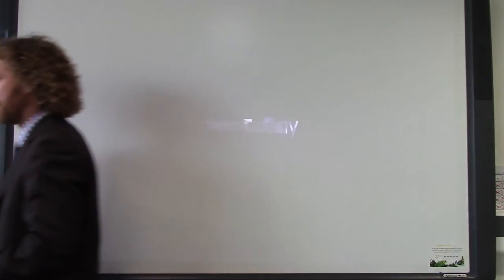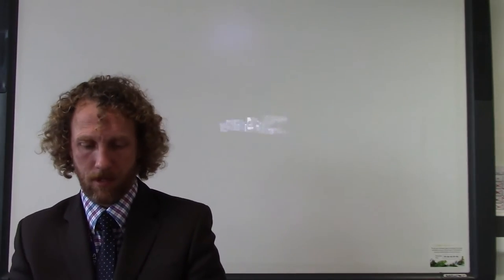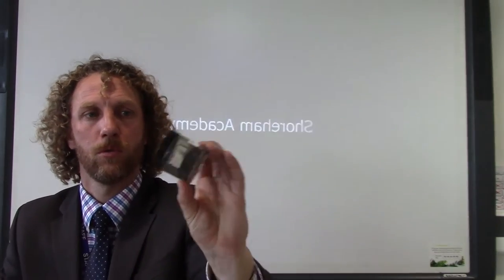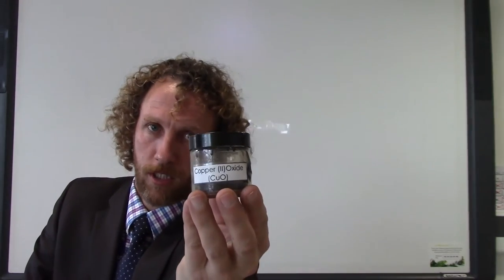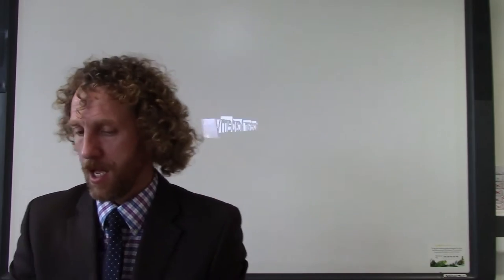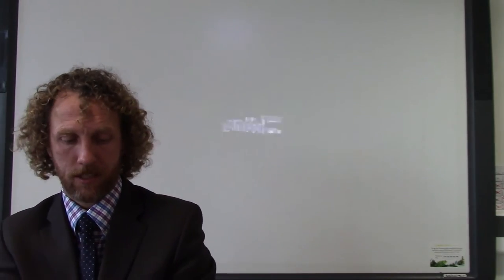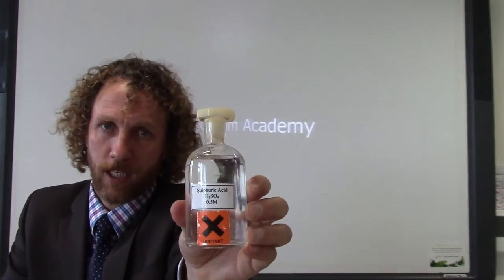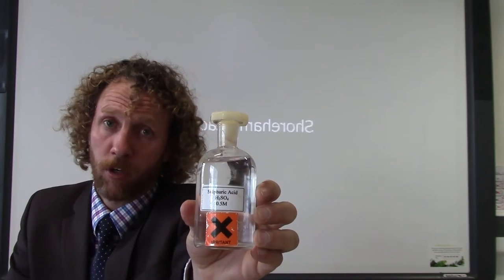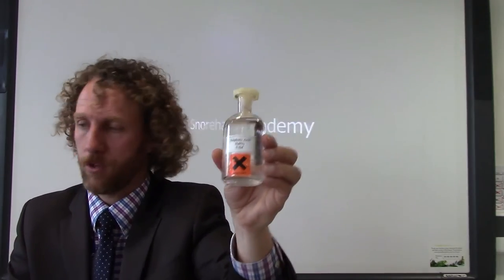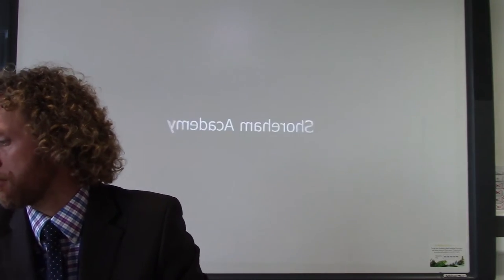We're using an insoluble metal base and an acid. The ones we're going to be using are a black powder called copper oxide and sulfuric acid, 0.5 molar which makes it an irritant so we've got the red cross on it.